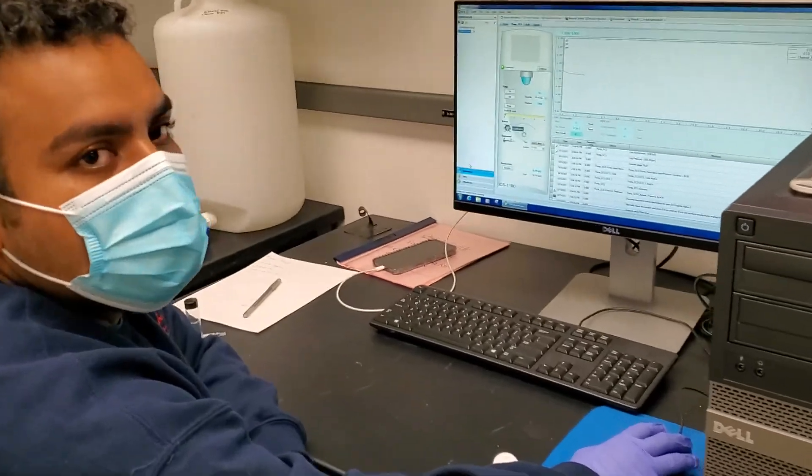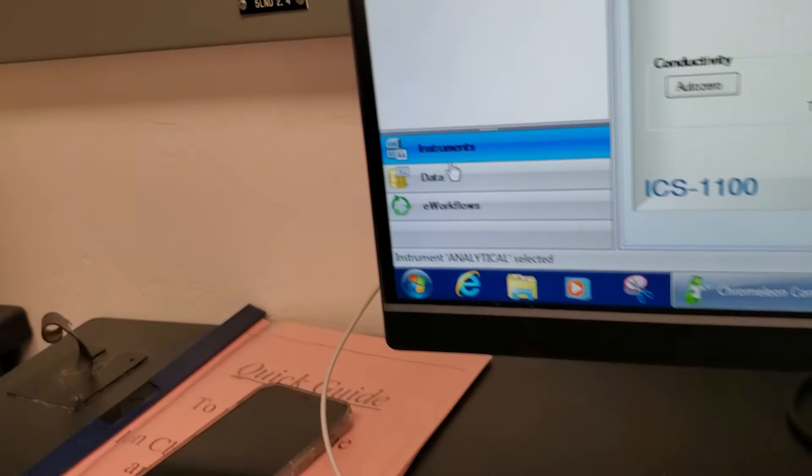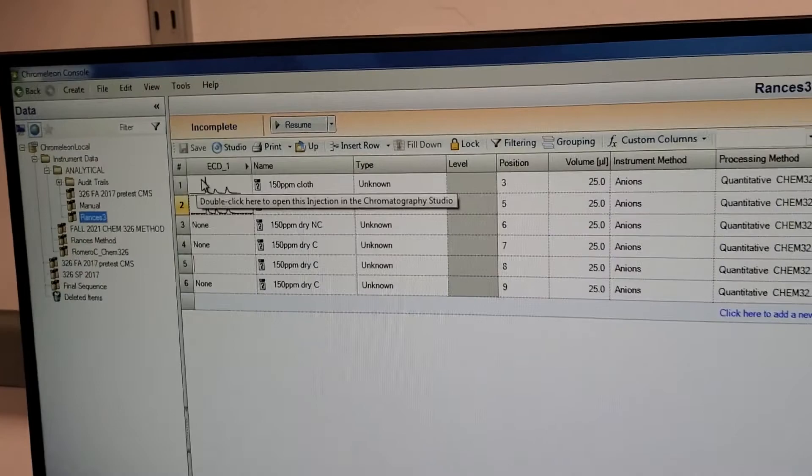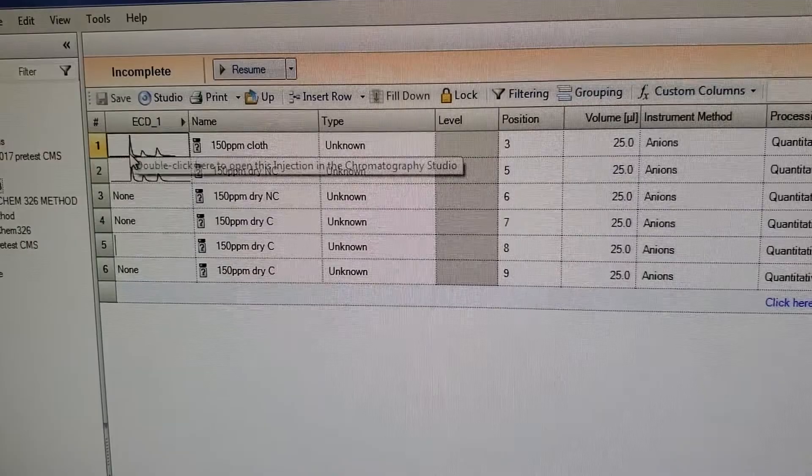Rancis shows us how to use the peak integration software. To access your results, go back to data over here. Under your sequence, you'll have all of your results. Just double-click on whichever results you want to check.